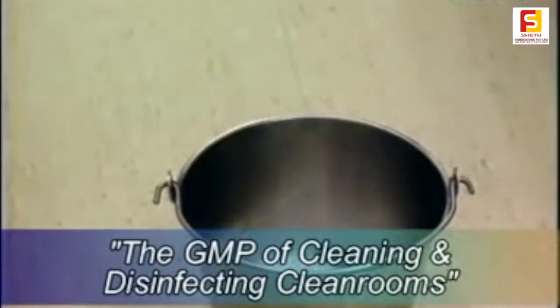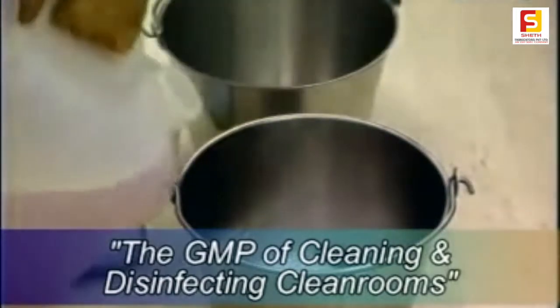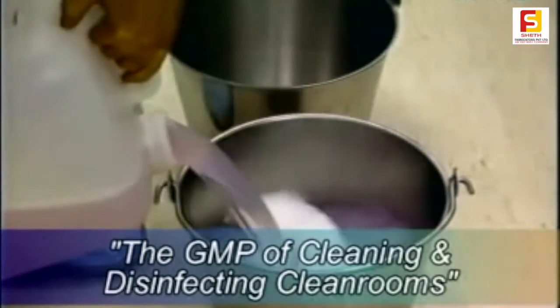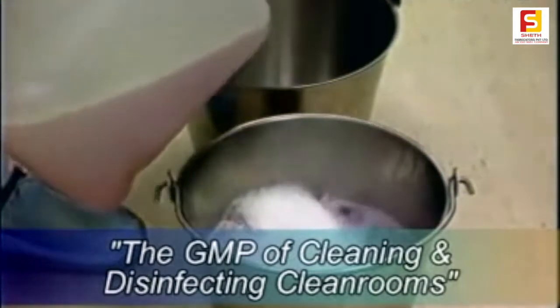This can be done using either a one-bucket or a two-bucket system. It should be remembered that many particles settle or are trodden onto the floor, so it's critical that the cleaning must be thorough.